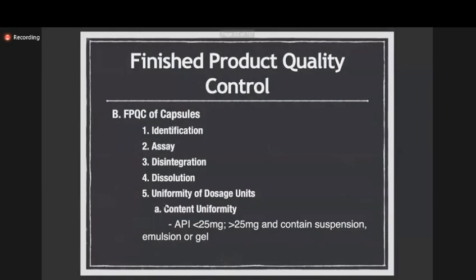Okay, next, for your capsule. For your capsule, we also do disintegration. Earlier, for a plain capsule, it is 30 minutes. For dissolution, it depends on your capsule. But we still perform the dissolution test for capsules. And then next, for content uniformity.